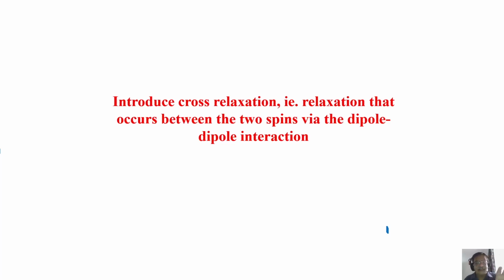Then we saturated spin transitions corresponding to one spin, and again recalculated the population difference, and we did not see any change in the intensity. And then wait for some time. After I remove the RF, the system will go back to thermal equilibrium. So nothing much interesting happened in spite of irradiating by the second radio frequency pulse. So I said there must be some other mechanism. Otherwise, how do we get the NOE?